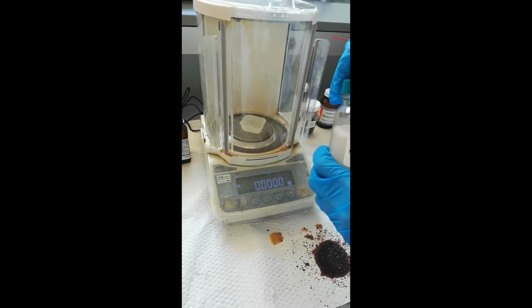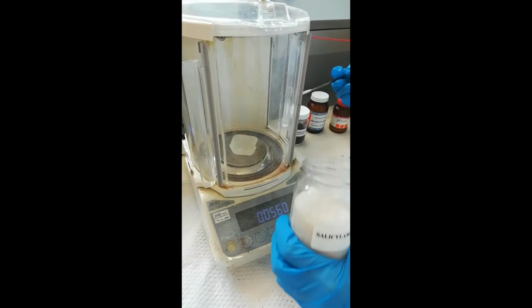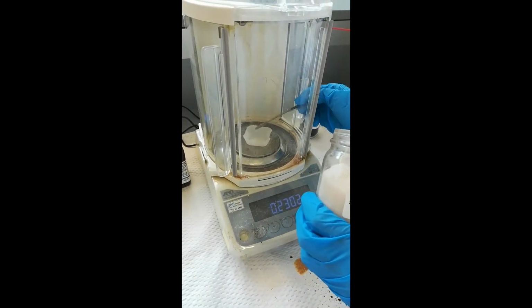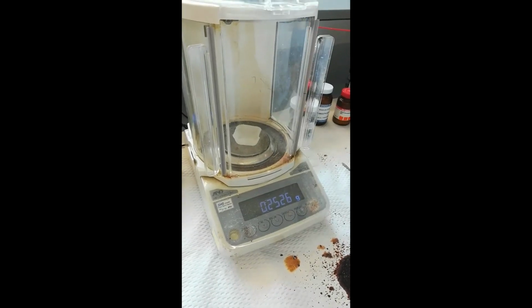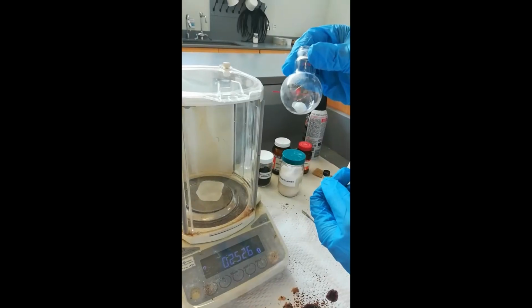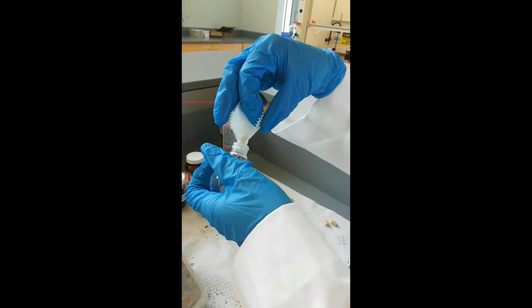So first things first, we have to weigh out the salicylamide, which comes in a white powder, like many of our other things. So we'll be weighing out 0.25 grams of salicylamide, something around that. We will transfer the salicylamide into a round bottom flask with a stir bar in it.